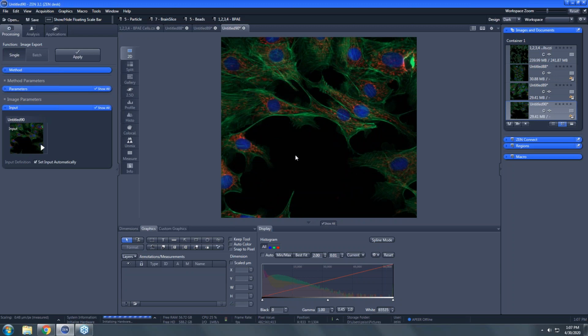Great. Okay. So this is 3 images that we're going to use for one of my favorite tiny little hidden features of Zen that for some reason we don't seem to be able to get across to people that they should be using, because everybody loves it when I show it to them. And that's what I call the figure maker. It's officially called the multi-image mode, I think, or split image mode, but it's this bookmark or open book icon, there you go, right here in the middle. Yep, multi-image splitter mode.